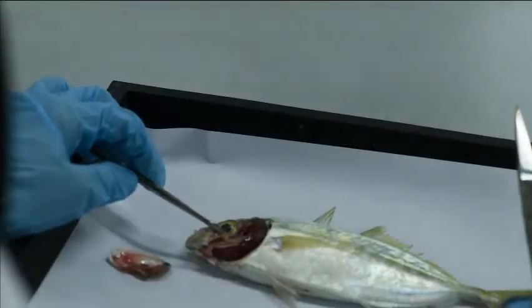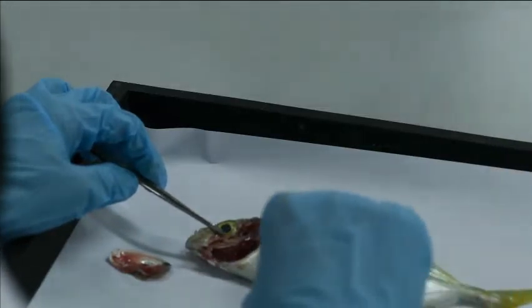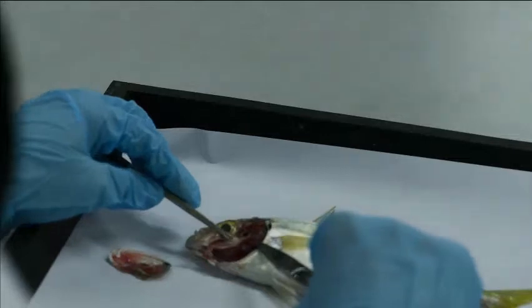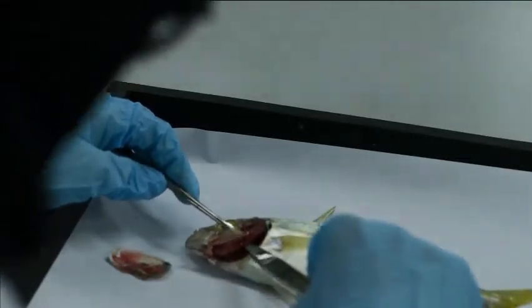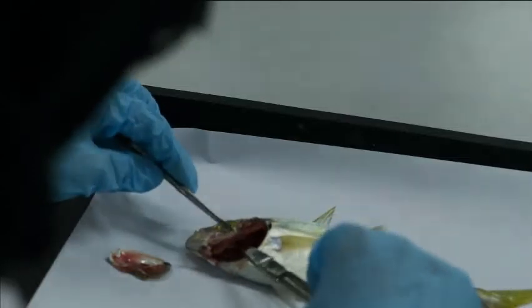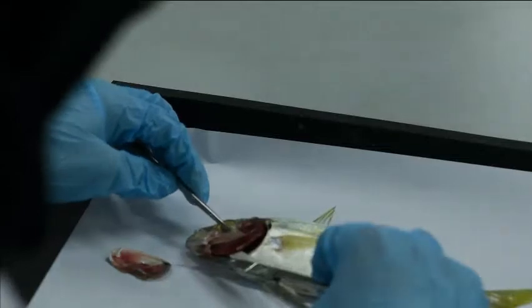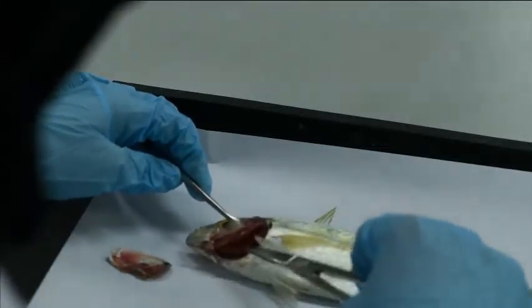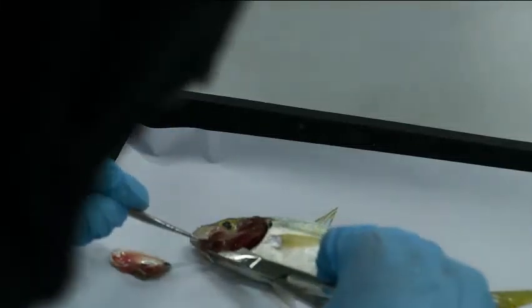For the third method, you need to remove the whole gill structure, and you take only one piece and put it in a petri dish filled with distilled water. Change the distilled water until there are no traces of blood or tissue. Then you need to observe under a dissecting microscope the gill rakers, gill arch, and gill filaments. Draw and label those structures.